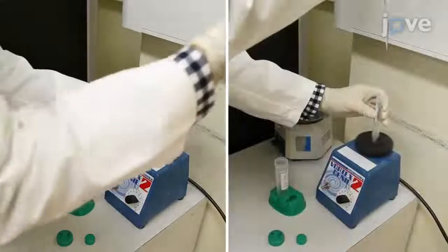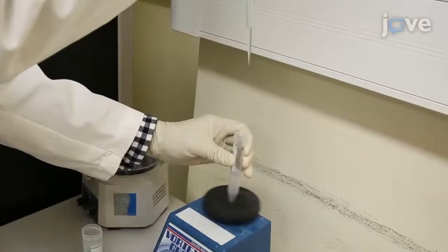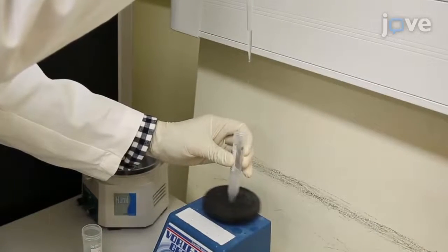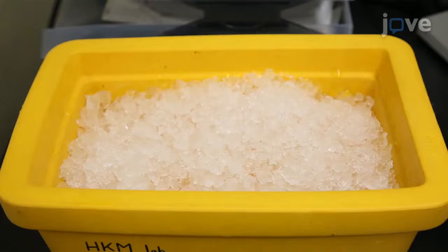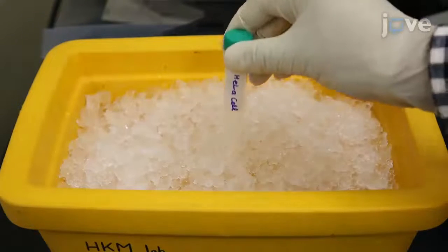After the second wash, replace the supernatant with 1 mL of 95% ethanol and mix the pellet by vortexing. Then place the fixed cells on ice.